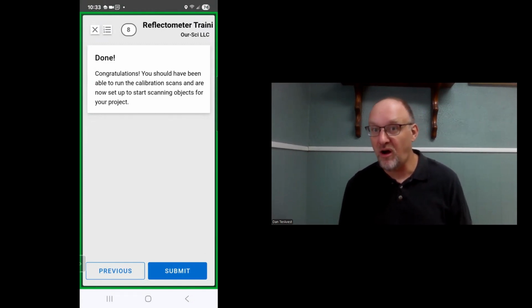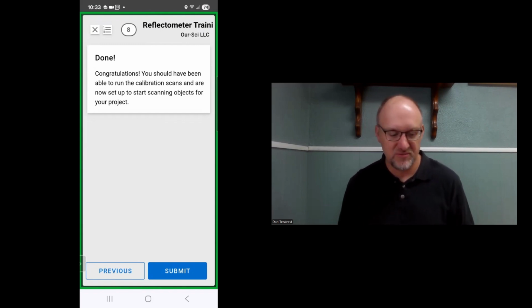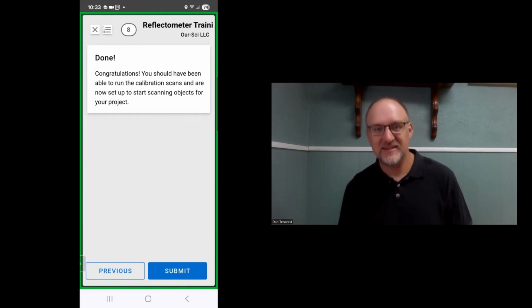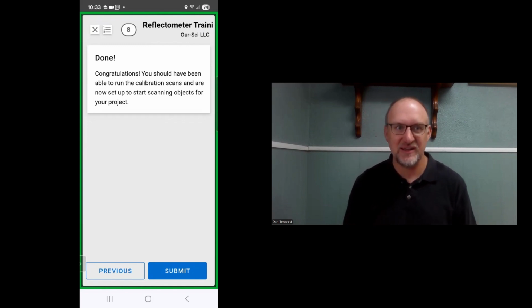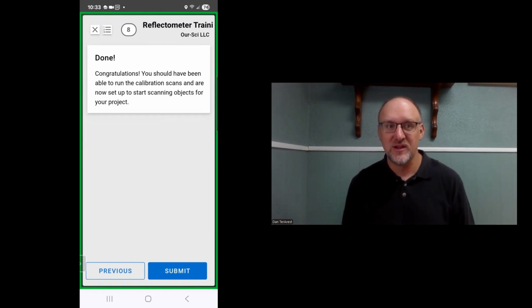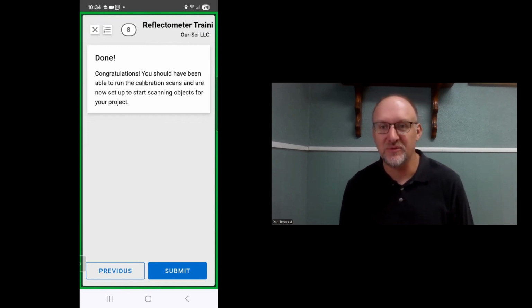If you are running a prediction model in the field, instead of this done screen that you see here, you would probably see something like run calibration, predict soil carbon, classify soil carbon, or something to that effect at this point, in which those values from the reflectance measurements would be fed into the model and you would get an output in real time.